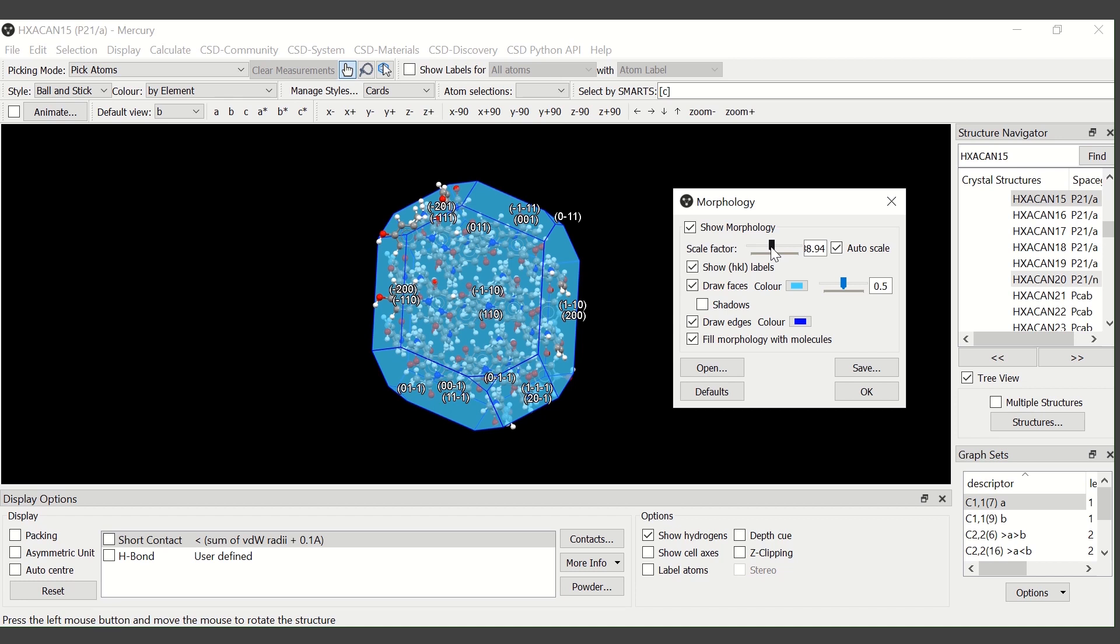You can also personalize the view of the morphology, changing the color of the faces.